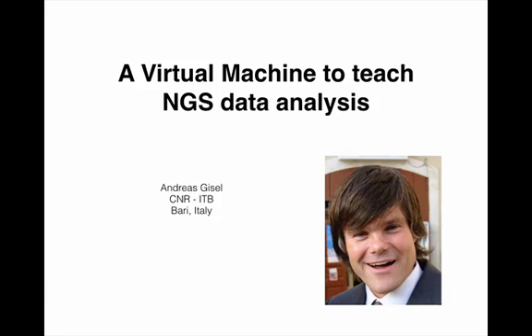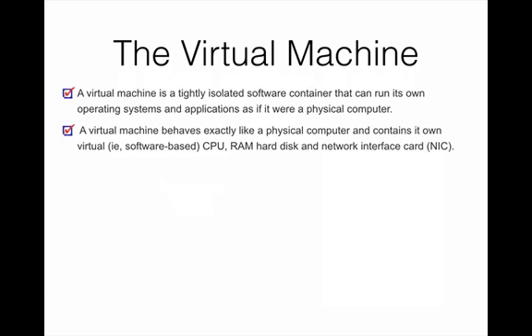With this presentation, I would like to give you a short insight into a virtual machine we developed for teaching next-generation sequencing data analysis. The virtual machine is a tightly isolated software that runs its own operating system and application within a physical computer without interacting with the file system of the host machine. The virtual machine behaves like a physical computer, having CPUs, RAM, hard disk, network interface, and so on.